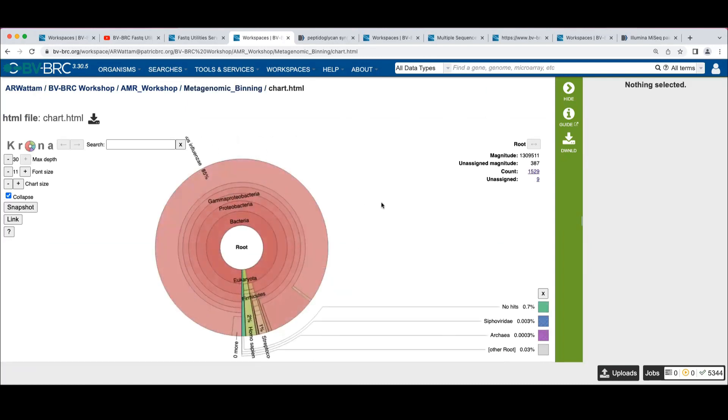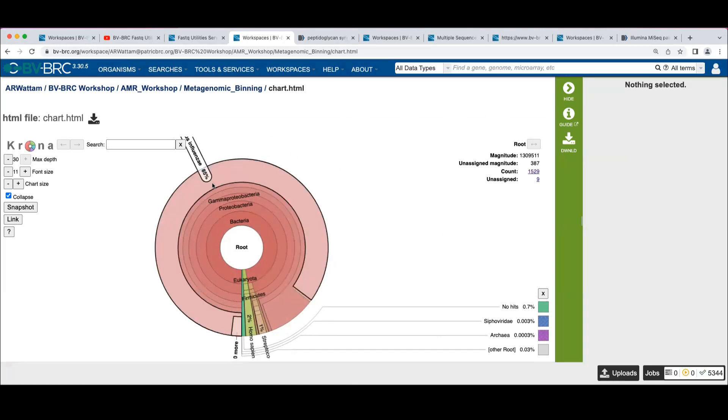This is the Chrona chart from that sample. We see that we've got this large number of reads that belong to Haemophilus influenzae. What we'd like to be able to do is pull those out into its own genome so we can look at it.